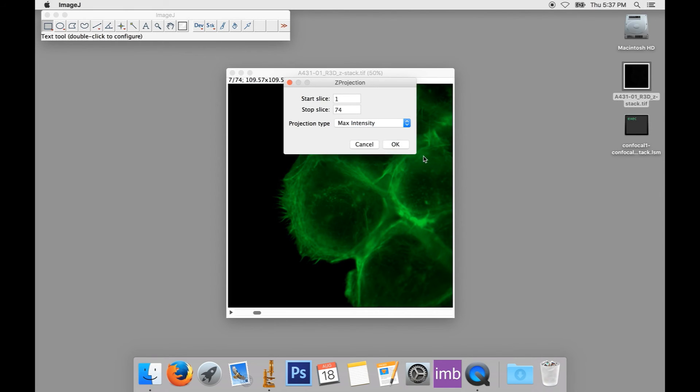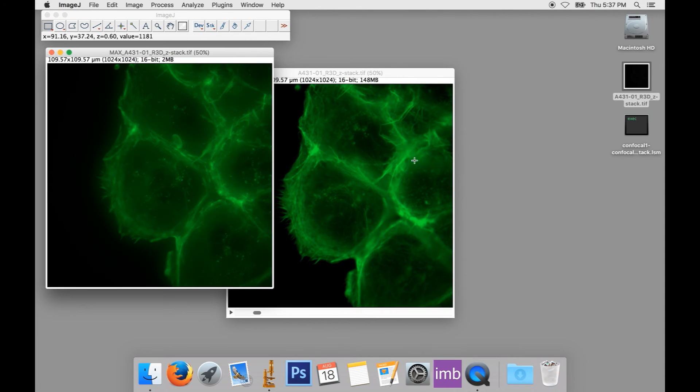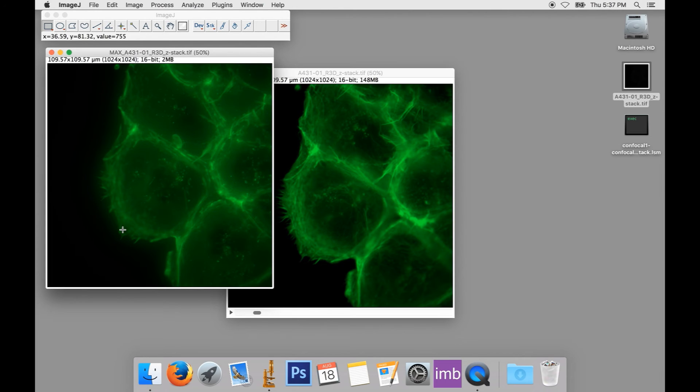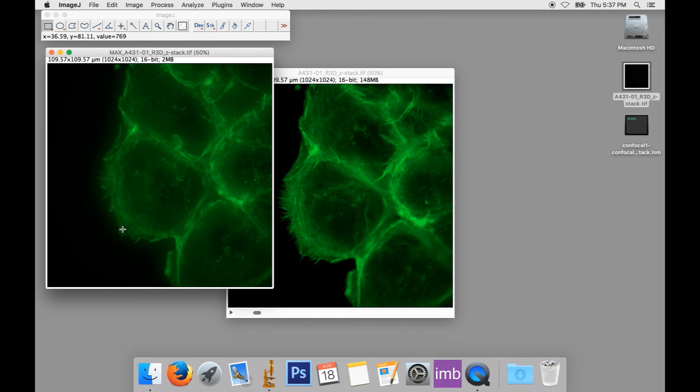So for example, if we select maximum intensity, which is probably the more commonly used of the two, and select OK, we get an image showing all of our information in focus at once more or less. What it's actually doing is finding the brightest pixel in the X and Y directions for each Z position. It's retaining that particular brightness. So that's the maximum intensity projection. That's why it's called that. It saves the maximum intensity at each X and Y position.